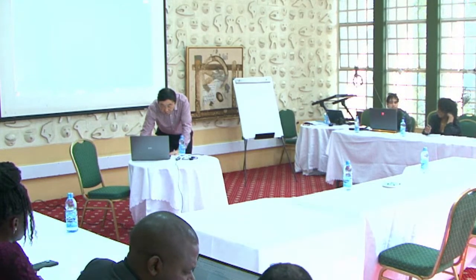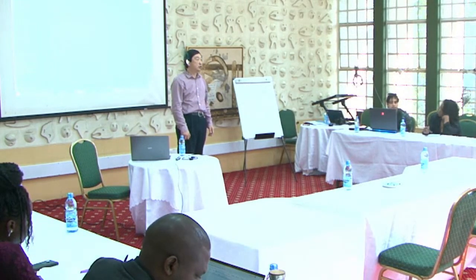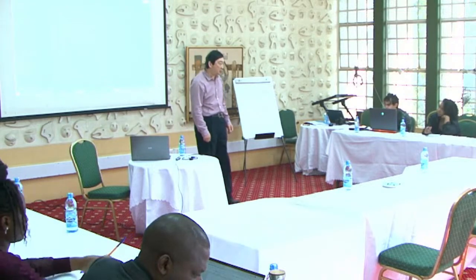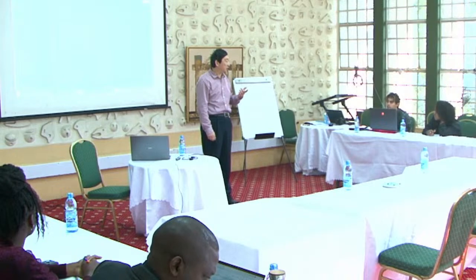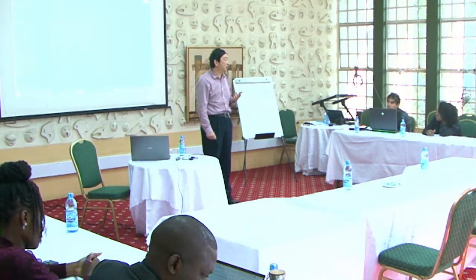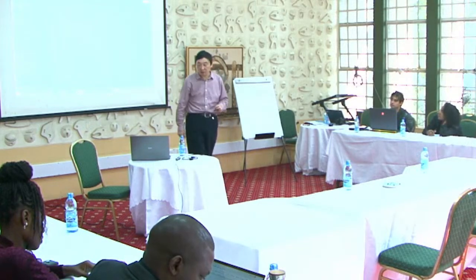So this table shows you some small masses, small pieces corresponding to the structure fragment. So you want to go through this table to familiarize yourself with these small groups. Then every time you see this group, you know you have this part of the structure.